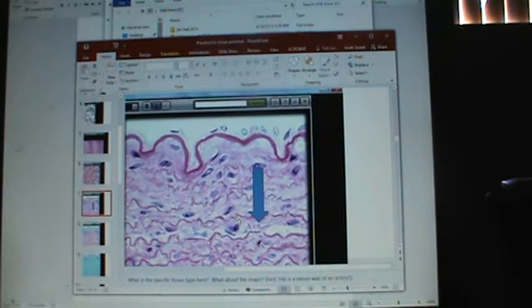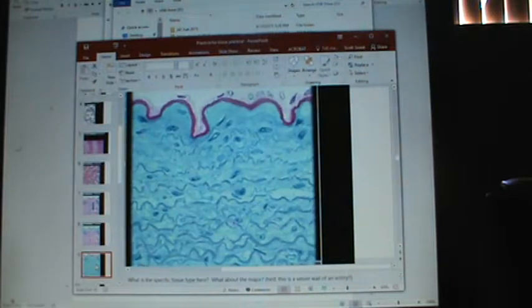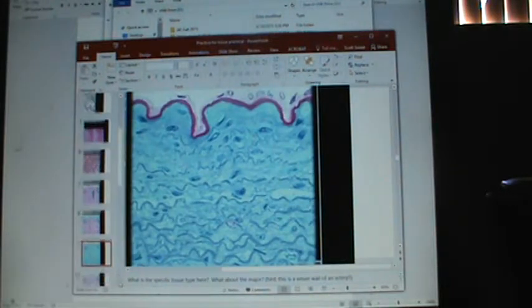So that being the case, the lumen would be here, and what kind of tissue would you have along this edge here? Always on vessels. Major tissue type would be epithelial. Specific tissue type? Only one kind possible. That would be the simple squamous. Nice. Alright, so let's go on. And we did that.